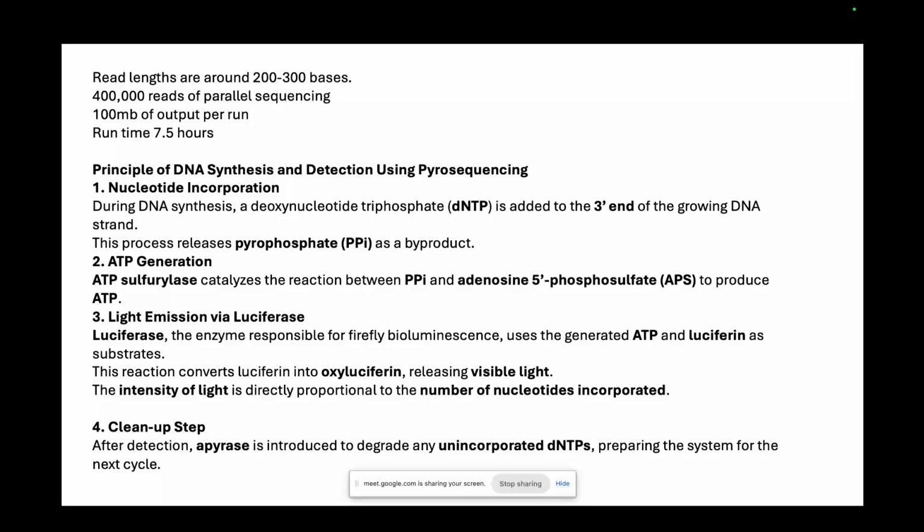Now the issue is that this is prone to errors, not only in pyrosequencing. Even with long read sequencing with Oxford Nanopore data, in real life when we handle Oxford Nanopore data, we see a lot of these homopolymer errors. If there had been 7 or 8 of the same nucleotide repeated one after another, nanopore might count 7 instead of 8, or 5 instead of 6, things like that.